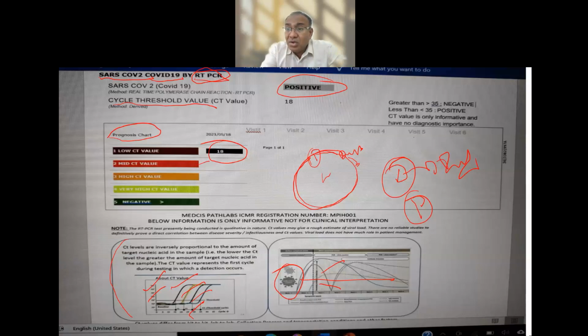Now, on the right side and upper column here, where I am putting my stylus and rounding up at this particular point, it tells me about some values. Once again, this is very important. When I was going through the different types of these molecular techniques, some people came to a conclusion that for a CT value of 24, a decrease of the CT value means the person is more affected, an increase of the CT value means the person is moderately affected, or we can say negative.